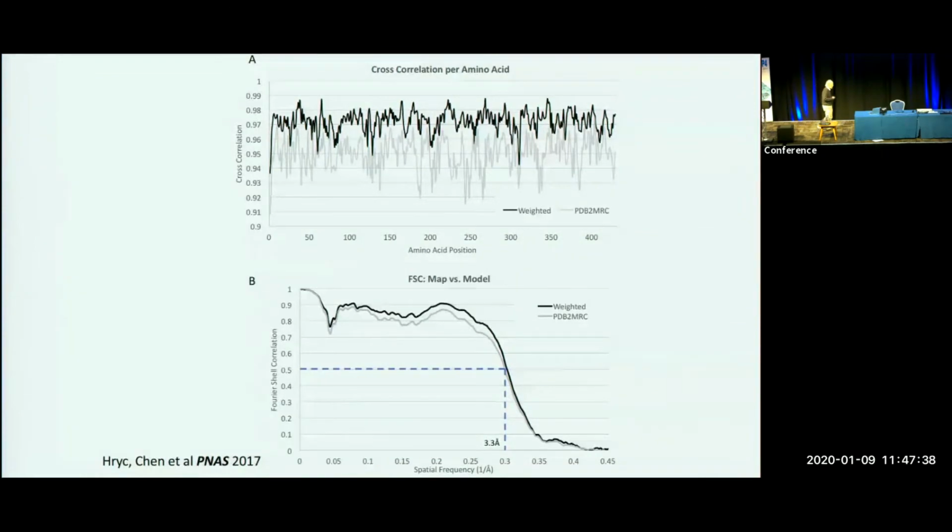Now, about 5 years ago, there was the so-called resolution revolution, where not only a few labs can do it, but many labs can do it, because of the advancements of the optics and the detectors. So we decided, I and Helen Berman at the RCSB at Rutgers, and also Ardan Patwardhan over at EBI, that we needed to get the whole community to do an experiment, as Kelvin talked about yesterday. You know, which model building is better, or which image reconstruction is better.